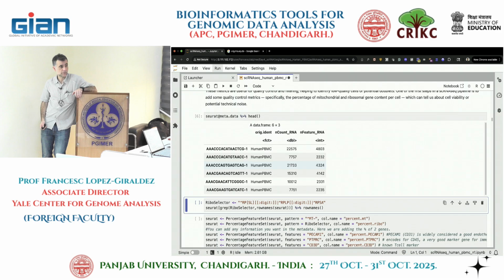Cells within the same sample. We only have one. Okay. We only have one sample, and these are the cells. And we named our sample, it took the name from whatever we called that project. But you can have a single Seurat object with multiple samples in it, if you want to. I mean, if you have a way to identify them.